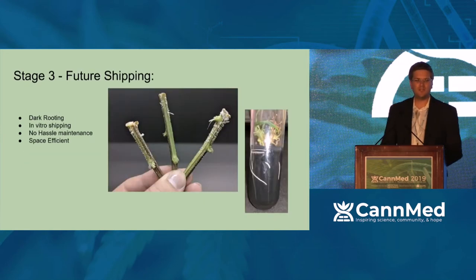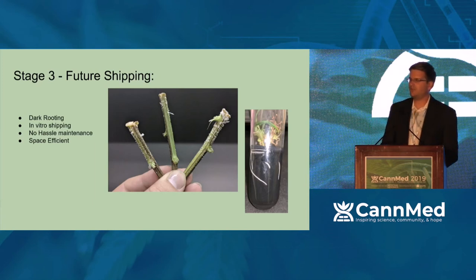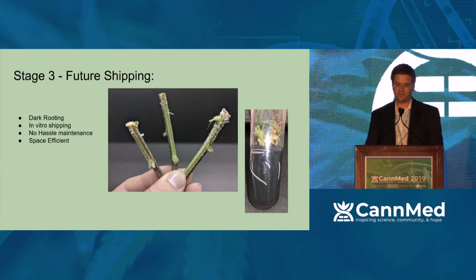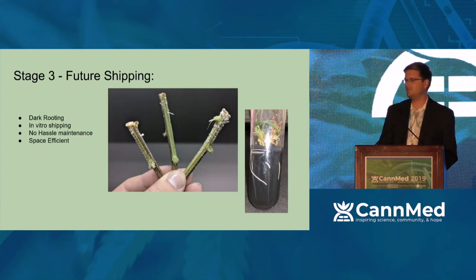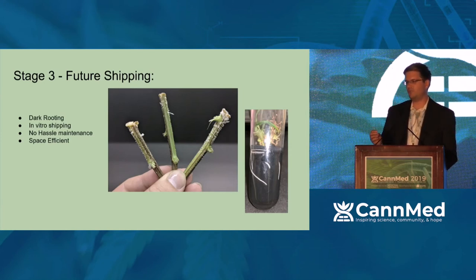So one of the keys I want to stress here is stage three has the potential to ship plants in the dark. I did a small scale trial on this where I did no more than 24 plants and I rooted them in the dark. That first picture is how I got the idea. I had cut a plant down, this is cannabis, and I had stuck it in a 55-gallon trash bag and forgotten about it for a little over a week. A week later, I just wanted to check, see if it had started molding or whatnot, opened it up, and there were roots all over the lower part of the plant, right where the callus or the undifferentiated cells really would have appeared. You can start to see those white little dots. Those are all root starts.